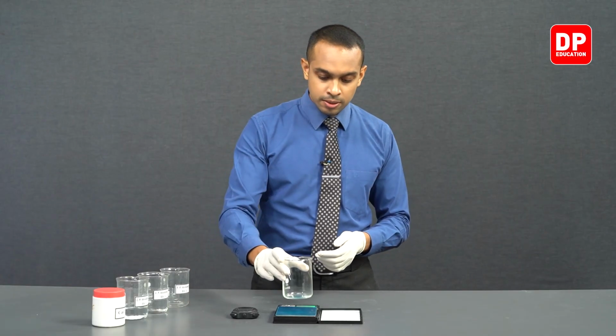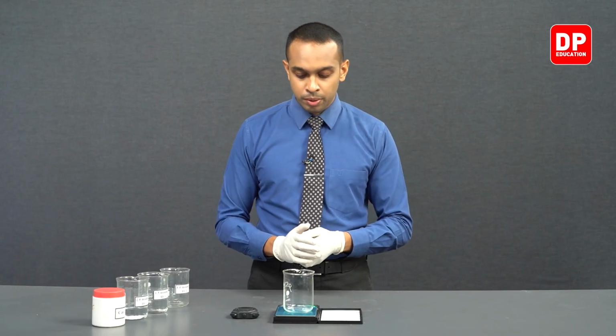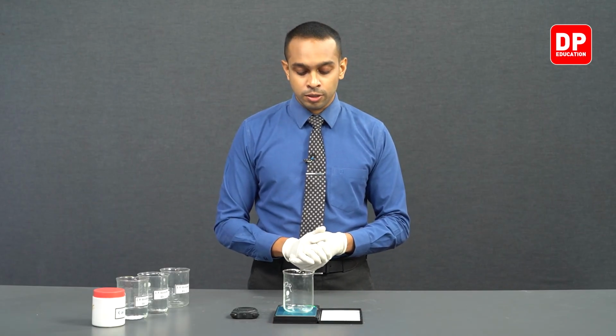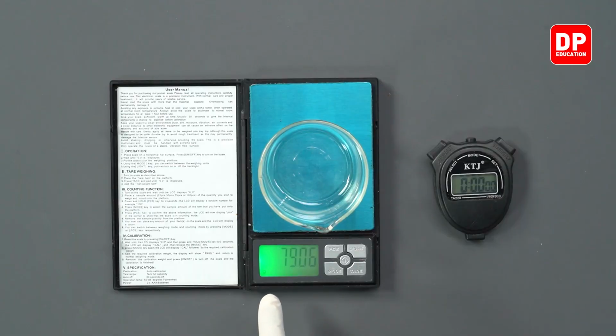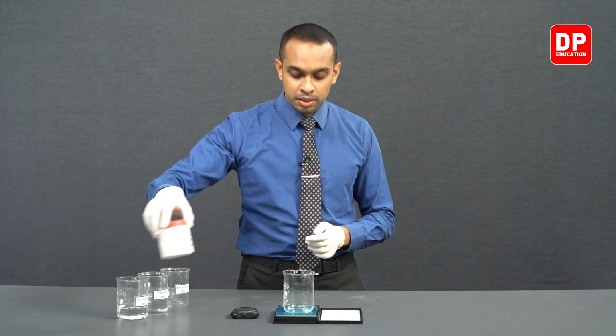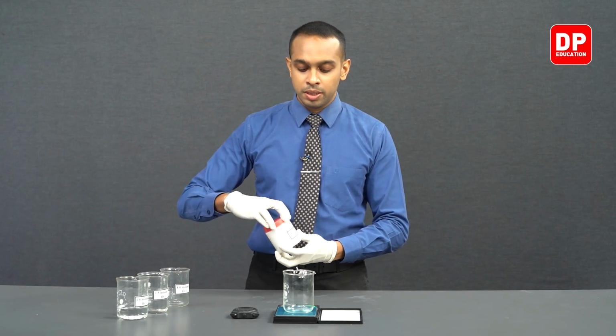So first, let's place our beaker on the balance like so. The beaker has a mass of 79.06 grams. Now students, after measuring the mass of the beaker, we can proceed to adding calcium carbonate to this beaker.